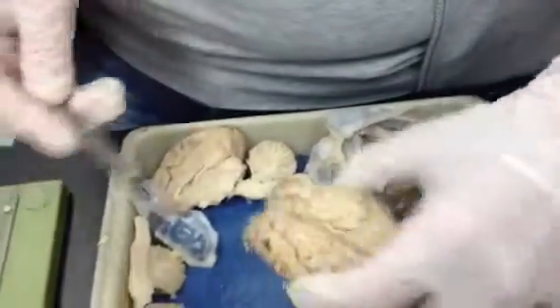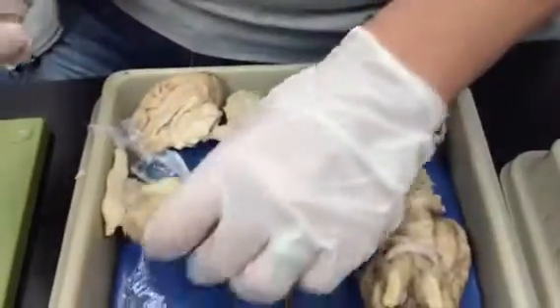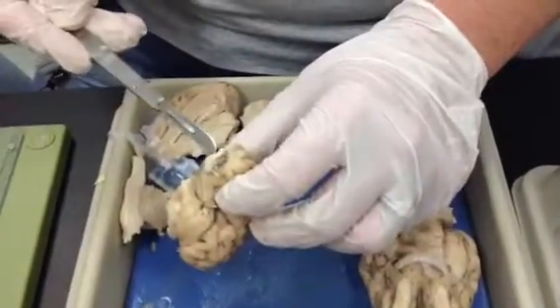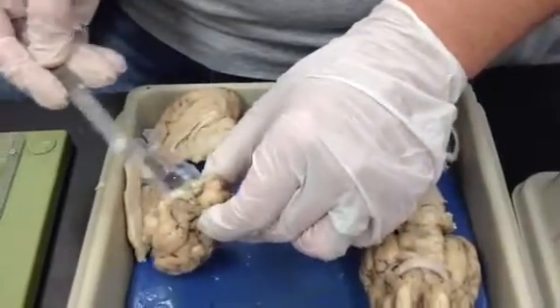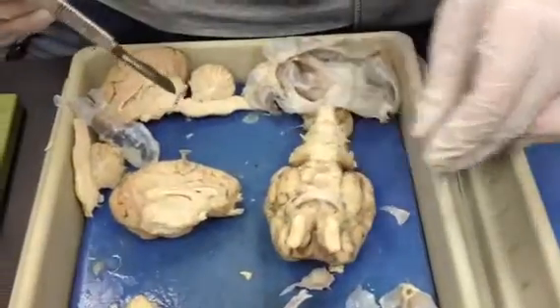And then, so we did the lobes, and what are these? These are very beautiful, by the way. Our last bulbs were a little bit hacked here. So those are the remnants of an olfactory bulb, but these are the olfactory bulbs. Remember, much bigger in sheep than in humans.